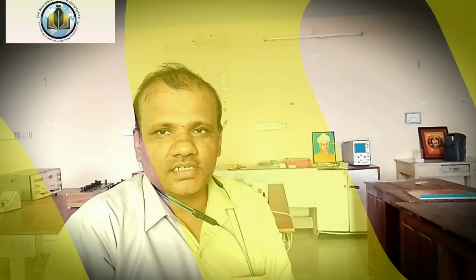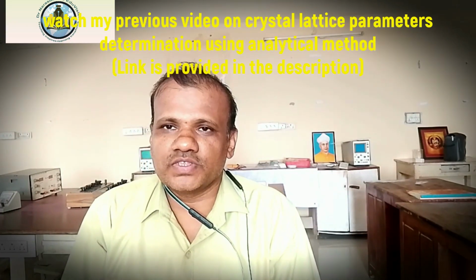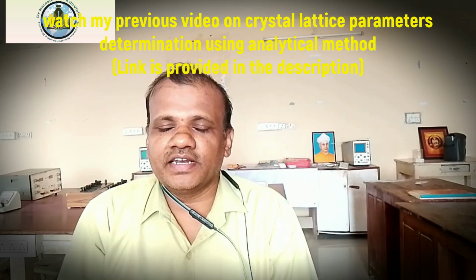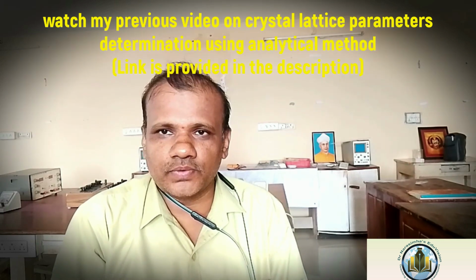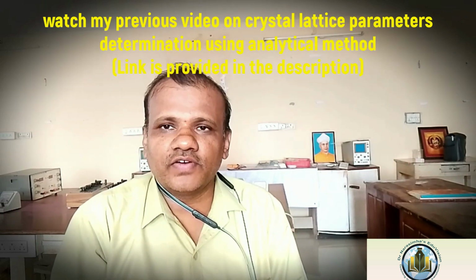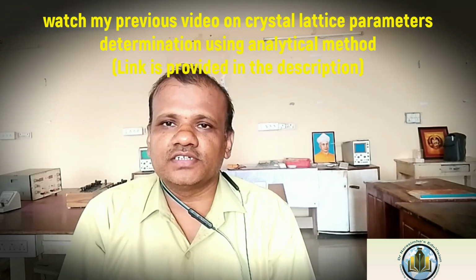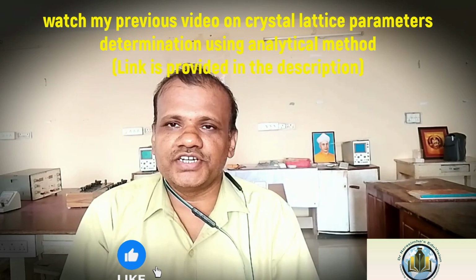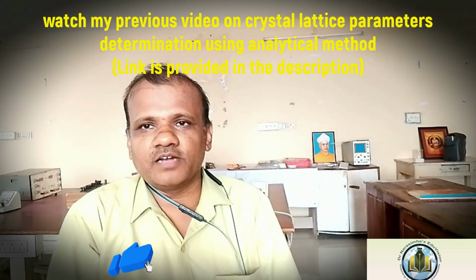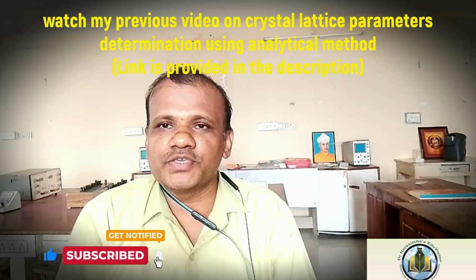Similarly, the intensity of the XRD characteristic peak is something we did not consider in the analytical method. So these are some limitations in evaluating lattice parameters by using the analytical method. You may not get accurate values for lattice parameters because we did not remove the noise, we did not consider the peak width, and we did not consider the intensity of the XRD characteristic peak. That's why you may not get perfect information about the lattice parameters when calculating by the analytical method.